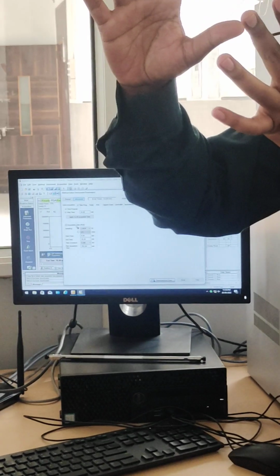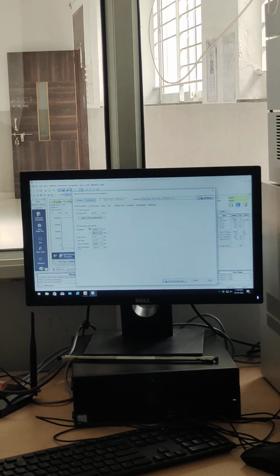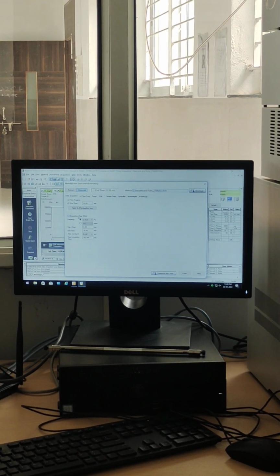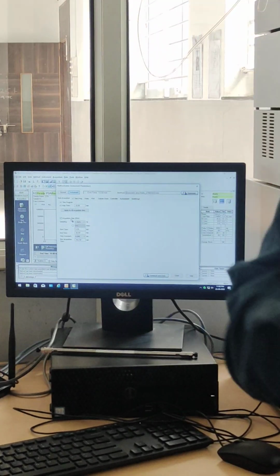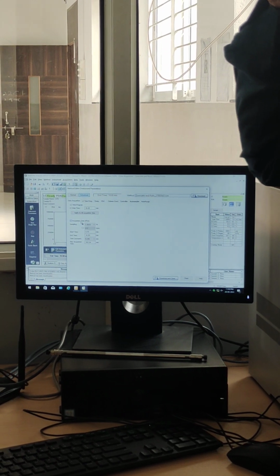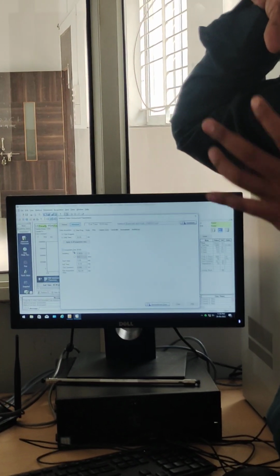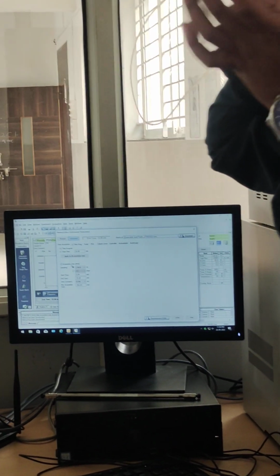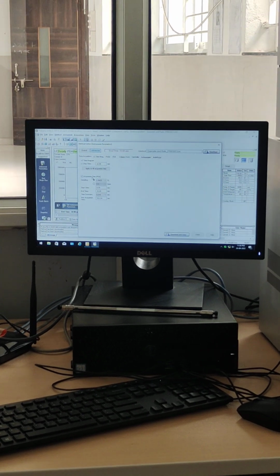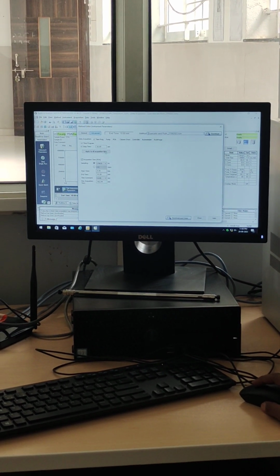If you keep pump time 10 minutes and acquisition time 5 minutes, what will happen? Only 5 minutes of results will be available. You will not get the peak, na? Because the detector is sensing the compound, it will keep watching for 10 minutes when we are getting the sample. Okay, that's why acquisition time, how much time do we have to maintain? 10 minutes. Correct? So yes, I have added 10 minute acquisition time.